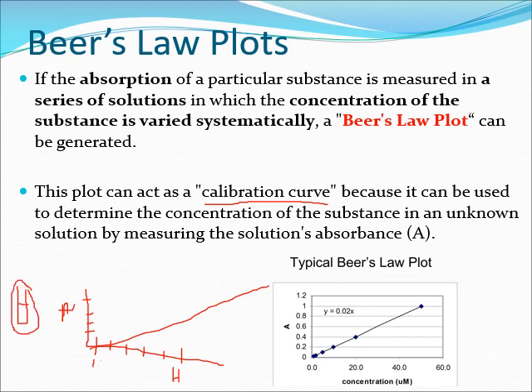You take your sample, in which you do not know the concentration of quercetin. We have made the standard curve earlier, and now you want to know the concentration of quercetin in this sample solution that you prepared. So you put your sample inside the cuvette and you read the absorbance value. If you get an absorbance value of 0.3, the absorbance value of 0.3 corresponds to what concentration, then you get the value of the concentration of quercetin inside your samples. That is the usefulness of the spectrophotometer, by having the standard curve. This will help you identify the concentration of your sample just by getting the absorbance from the spectrophotometer.